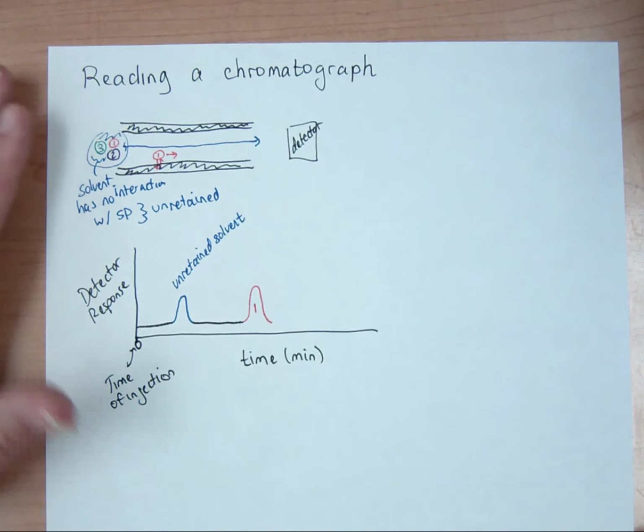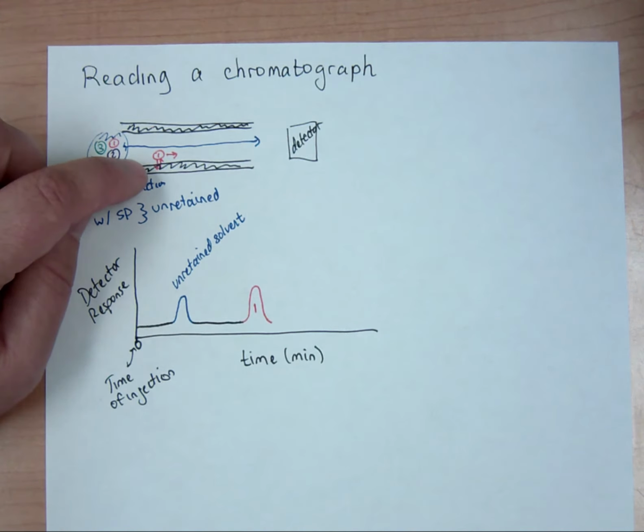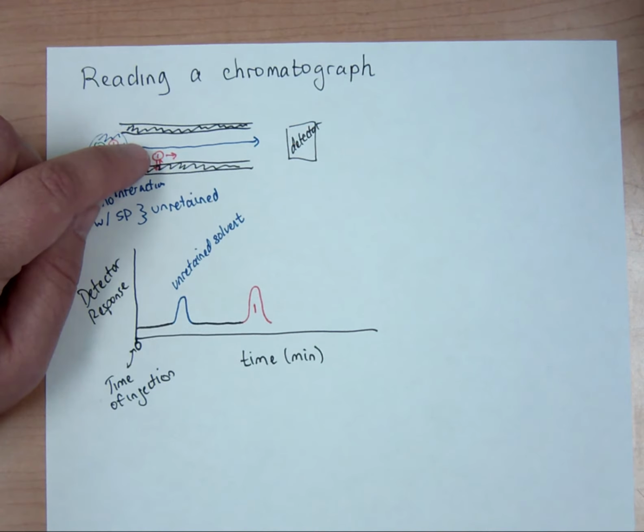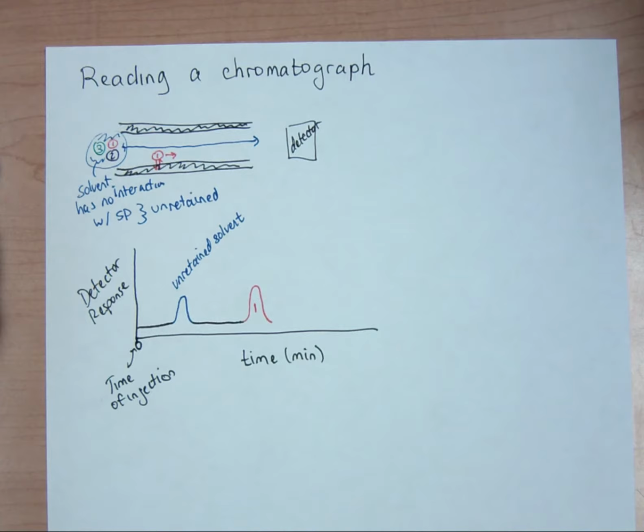Okay. Now, analyte 1 comes out first, and this would mean that analyte 1 has a stronger affinity for the mobile phase, so it's more likely to be in the mobile phase that's moving quickly down the column, and a weaker affinity for the stationary phase, which means it will not spend as much time stopped during this time of analysis, so it comes out first.